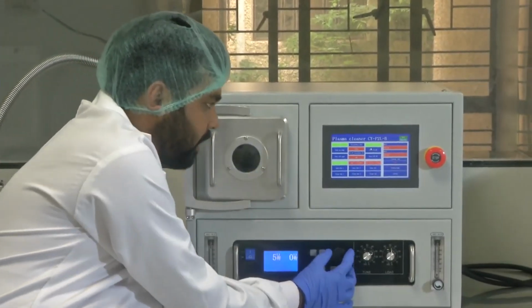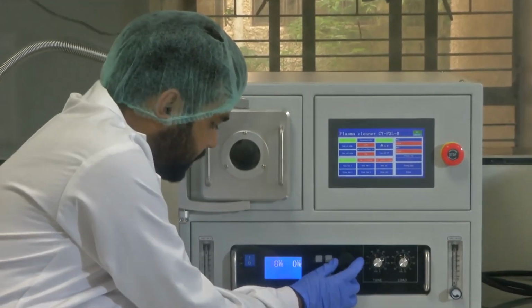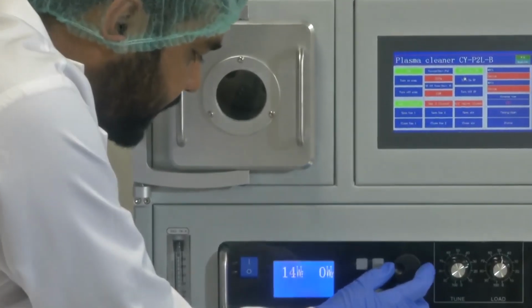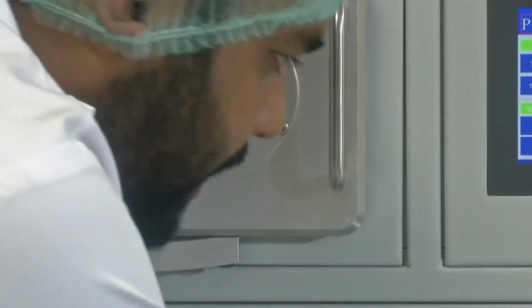Now let me increase the RF power. Now it is 6 watt, 7 watt, 8, 9. I am slowly increasing it. It is 15 watt now, forward power. But the return power has become 12. So I need to adjust it.